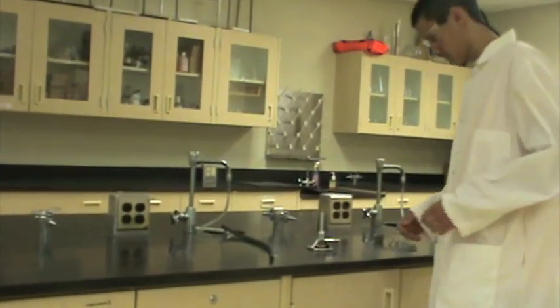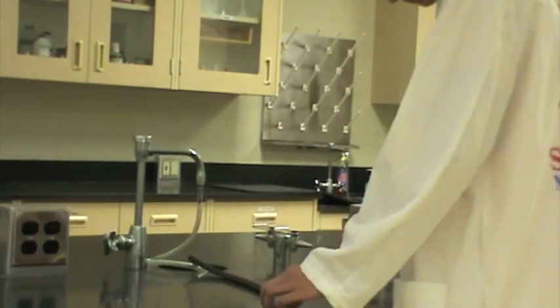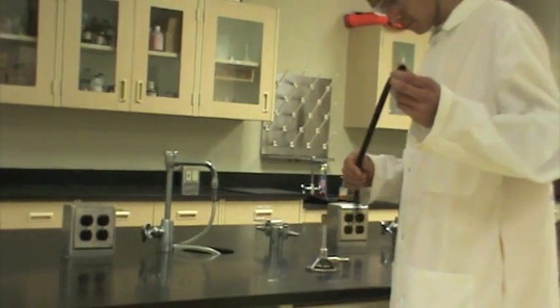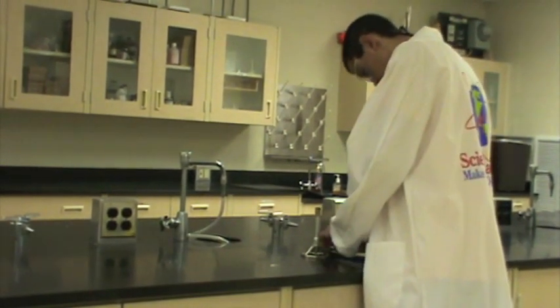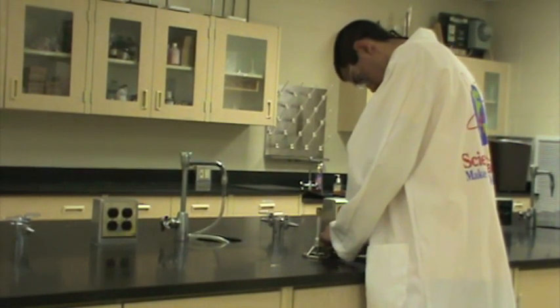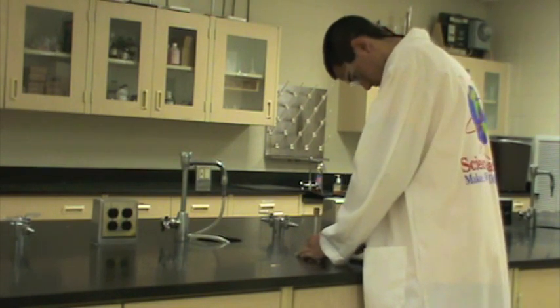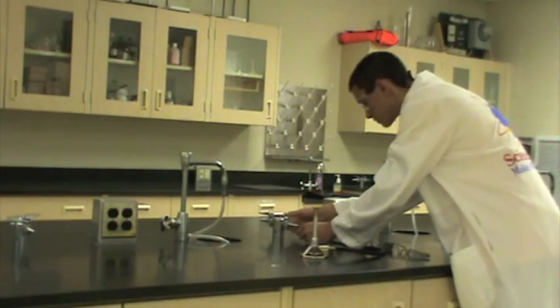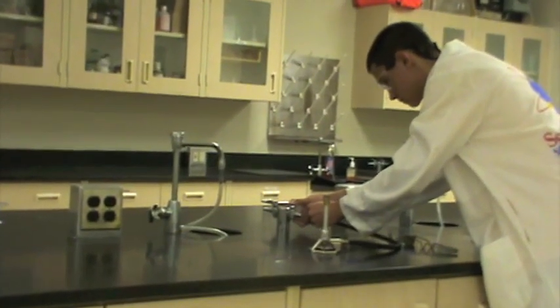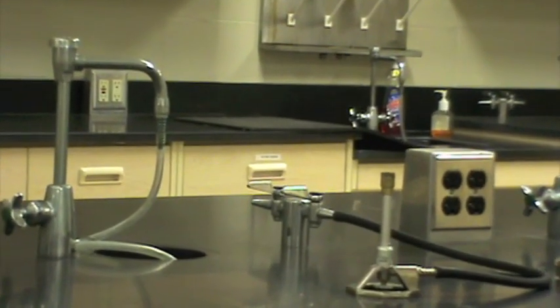The first thing you will want to do is make sure your equipment is in proper working order. Take particular care to check the rubber tubing for cracks. If everything looks okay, attach one end of the rubber tube to the burner. You don't have to push it all the way on, just make sure it's secure and won't fall off. The other end of the tube should be attached to the gas valve on your workbench. Once again, it doesn't have to go all the way on, just far enough to be held securely.